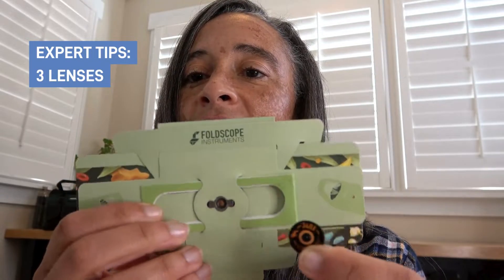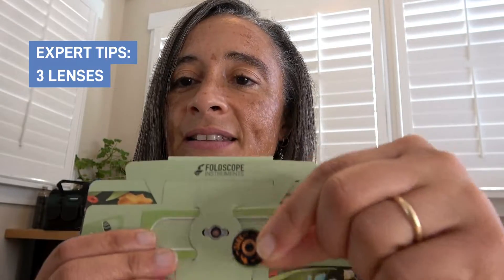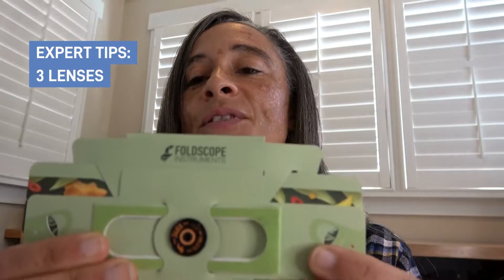What you can do is take off your lens and then rotate it 90 degrees, which will allow the magnets — rather than sticking to the metal part that's visible here — to stick to the paper part of the Foldscope instead.